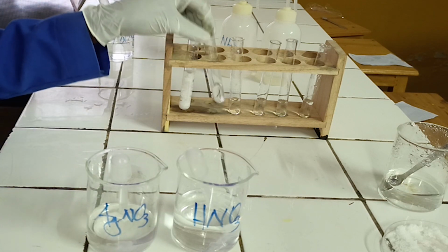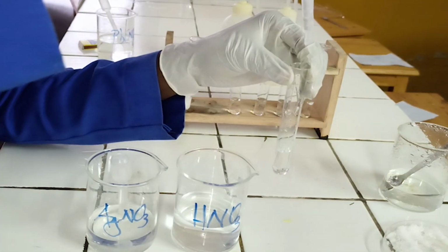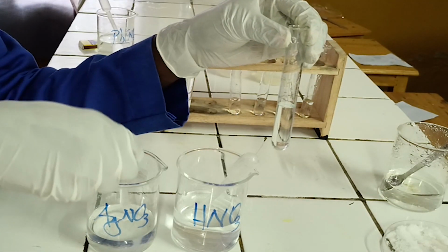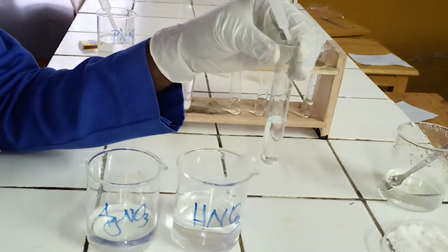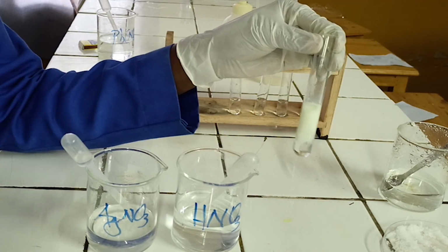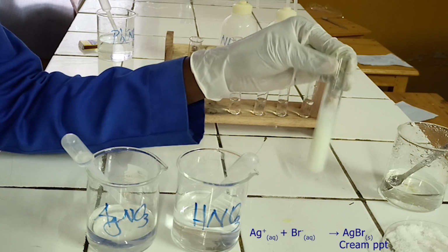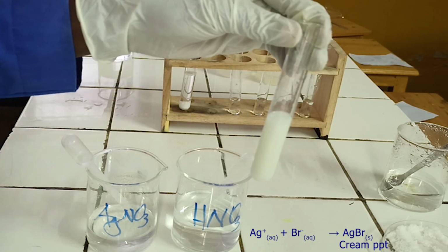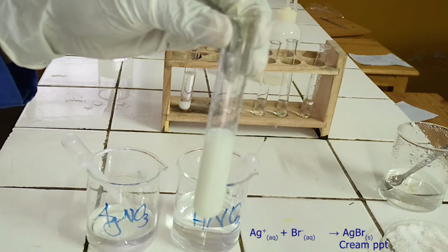To the second test tube, add diluted nitric acid followed by silver nitrate solution. As you see, silver nitrate solution reacts with bromide ion to form a cream precipitate. The cream precipitate formed is insoluble in diluted nitric acid. Below, there is the ionic equation for this reaction.